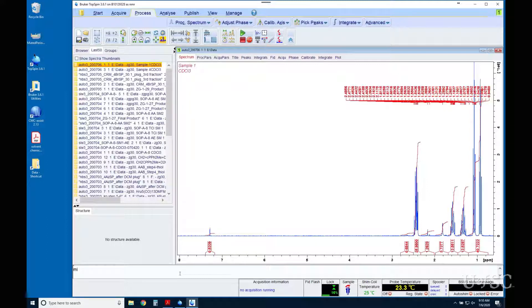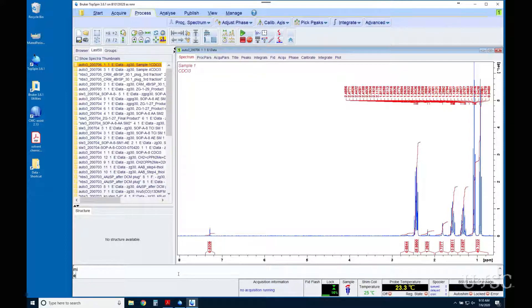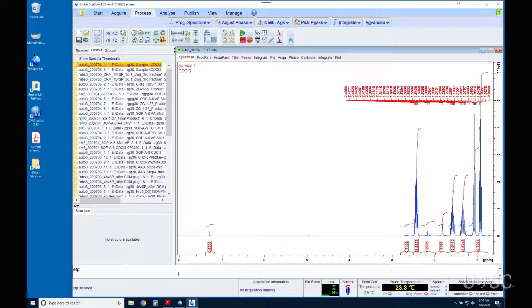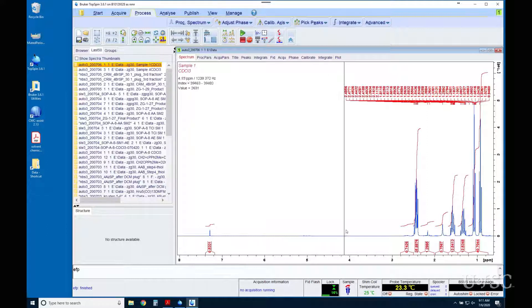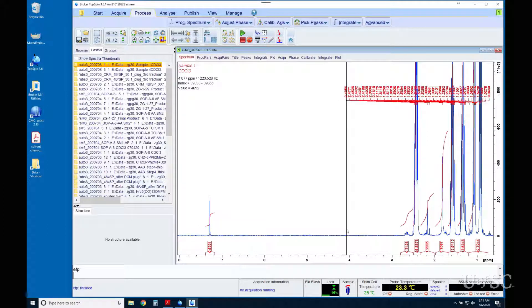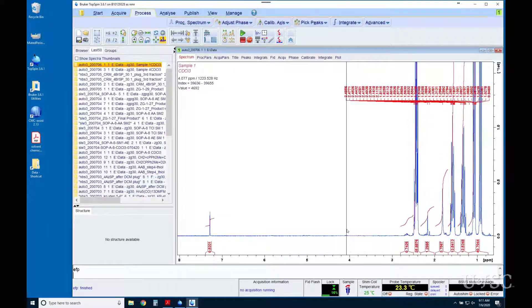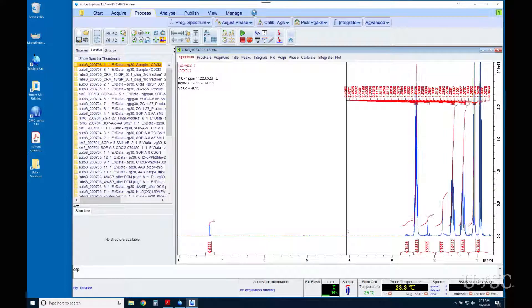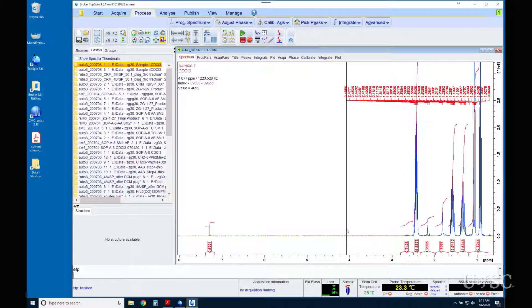Before you make any changes to your data you should reprocess the spectrum with the EFP command. This removes the baseline correction that the automation performs to give better integrals. This might distort the baseline and make phasing more difficult. The EFP command actually performs three tasks and each letter in the command represents the steps involved.